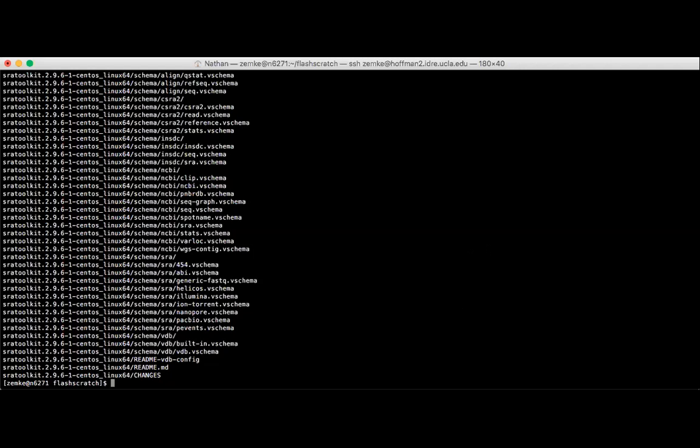So if you're having trouble with the command, try copying and pasting it, because oftentimes when I have trouble, I type something incorrectly.